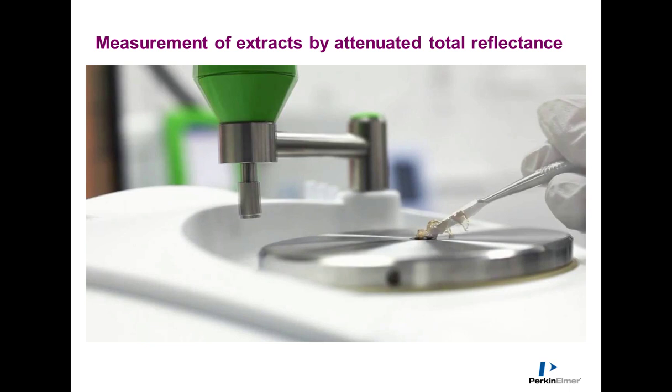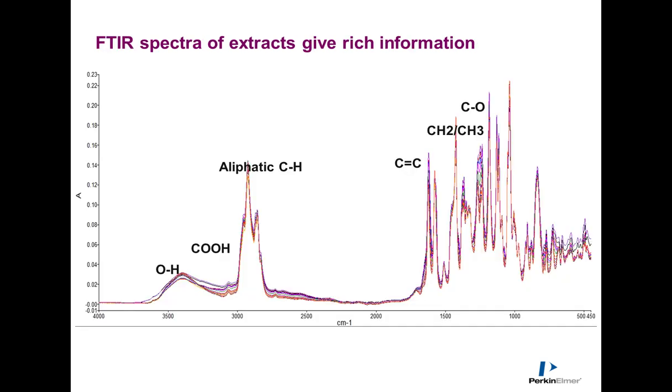We address this by using FTIR. And what you're looking at here is the stage or the sample of oil that's taken from a larger reaction batch. This can be taken every 10-15 minutes, very quickly and easily, but it can then provide insight into how quickly that decarboxylation reaction is happening.